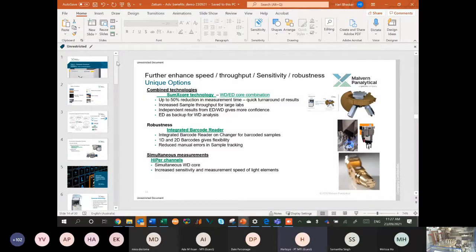Not very sure. We don't have anything called spectra element and spectra applicant. Where is that info coming from? Is it related to the Zetium? Wait a minute, I will ask. All right, guys, in the meantime, if you do have more questions, do pop them over in the chat.